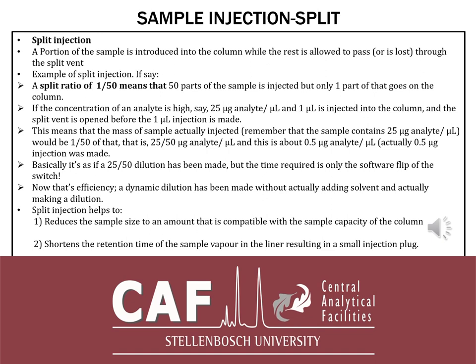So that's how I always explain to people the importance of understanding split and splitless injection, especially for students. That question that I asked earlier, if it's one peak, it can give a lot of answers. It helps you understand if you know the difference between a split and a splitless injection.